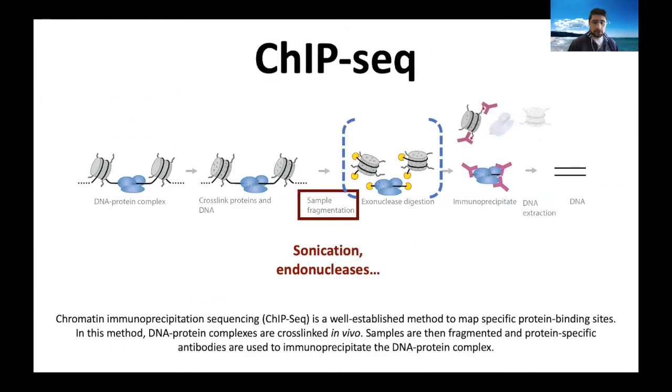Okay. So who knows what ChIP sequencing is? Who wants to type in the chat what is the purpose of this type of approach? Let's see if we got some answers.